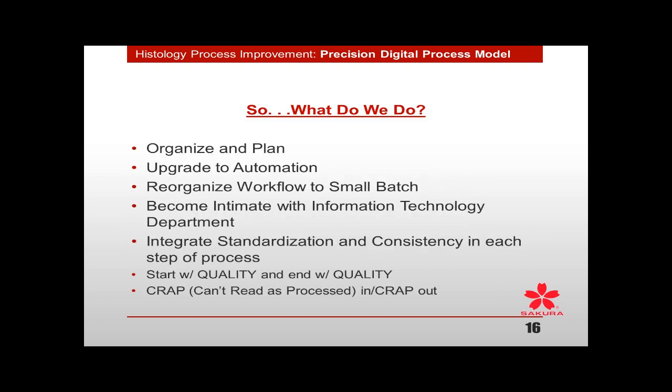You've got to organize and plan again. I know this is an overview, and I hope you understand that it's not simple. It is going to take some organization and planning. Use continuous flow automation if possible. If you're not doing that, you're developing a whole new workflow that can't truly be optimized.